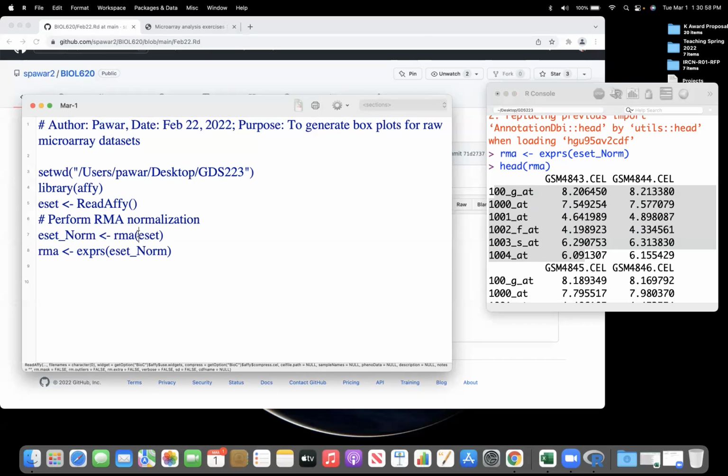What is your console? Where is your answer? Let's rerun again.